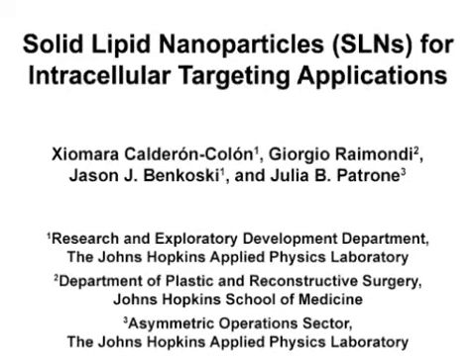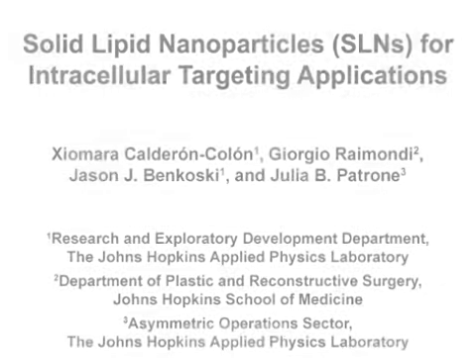The overall goal of this procedure is to synthesize ultra-small populations of biocompatible nanoparticles, characterize their physical properties, and investigate particle-cell interactions.